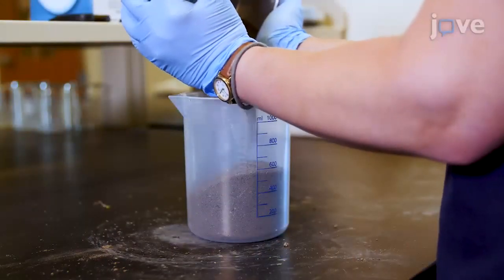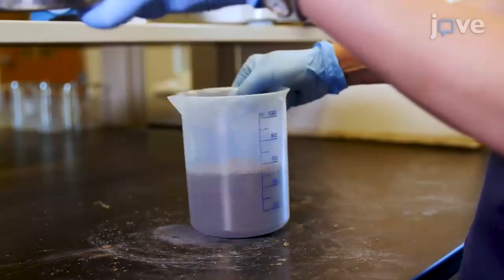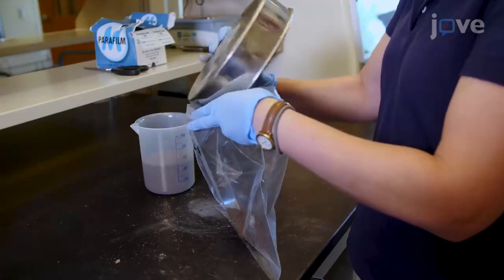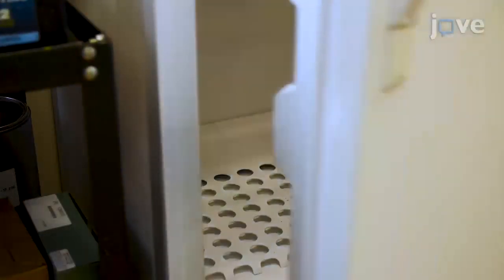Then, measure out a 500 milliliter subsample using an empty beaker and reserve for chemical analysis. Use the remaining sieved soil for microcosm studies or store in polypropylene bags at 5 degrees Celsius for later use.